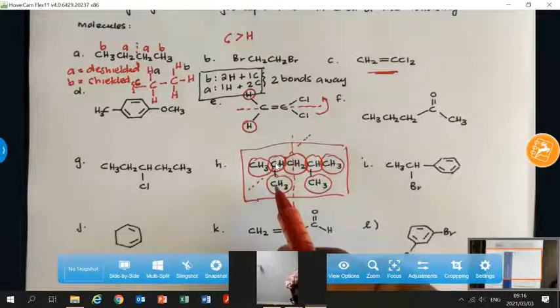And I'm going to try and put numbers to these. I see my screen just froze a bit. I'm going to try and see what's going on.